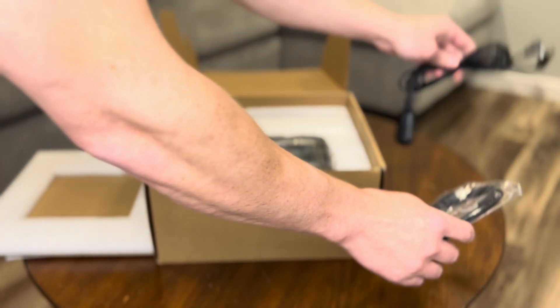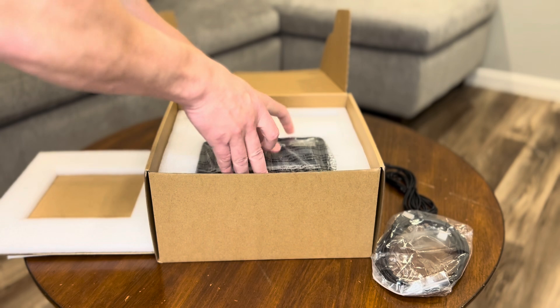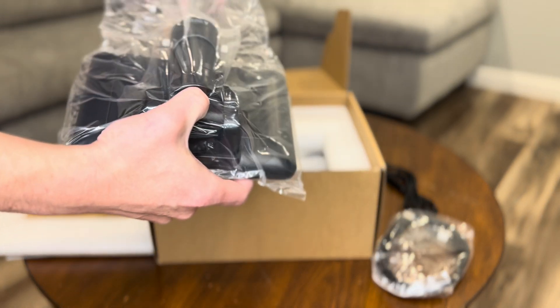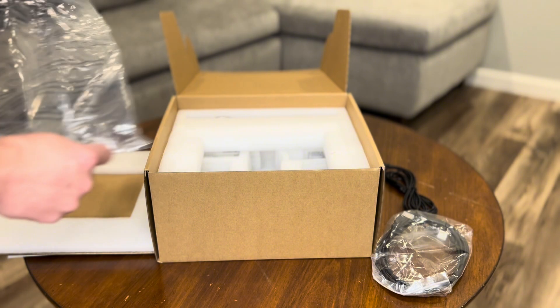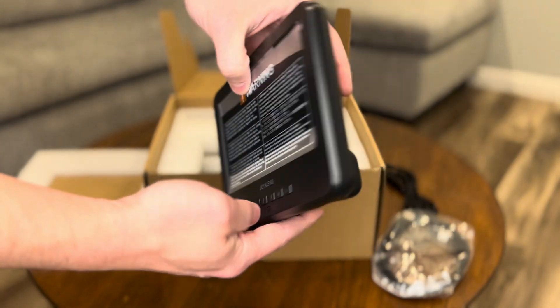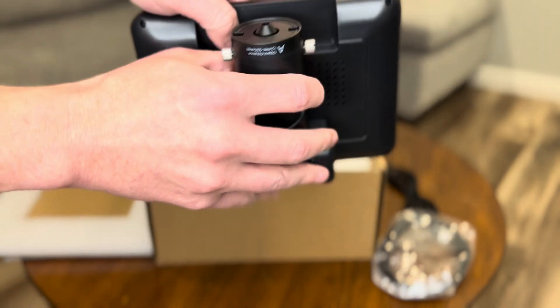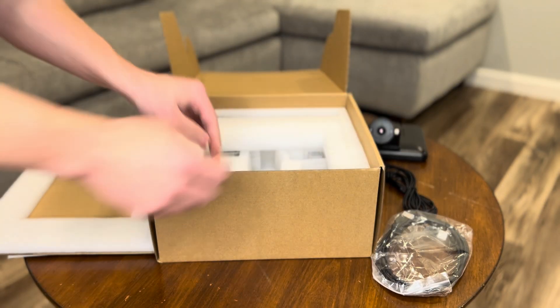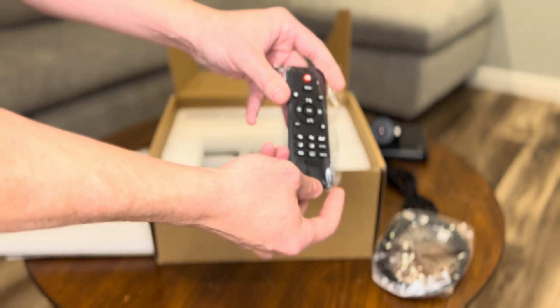The microscope feels really solid. It has a nice weight to it. The 7-inch display is already attached, which means less hassle for setup. It's got a really sleek, modern design, so it's perfect for desk use. This model also comes with a remote, which is nice to use when you're trying to adjust the microscope without causing a shaky image on your screen.